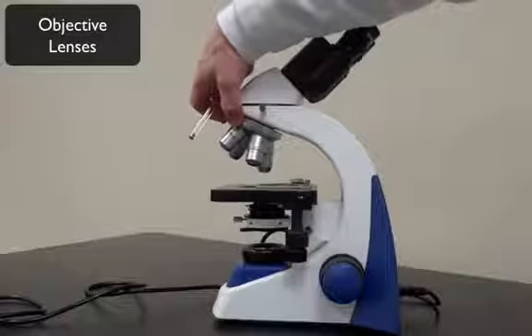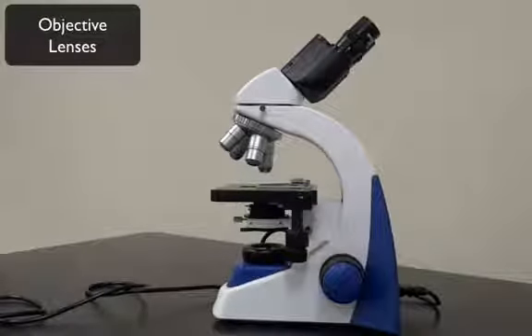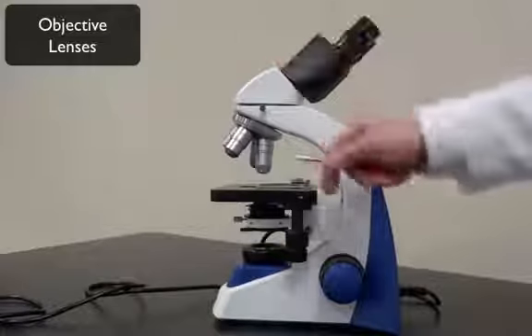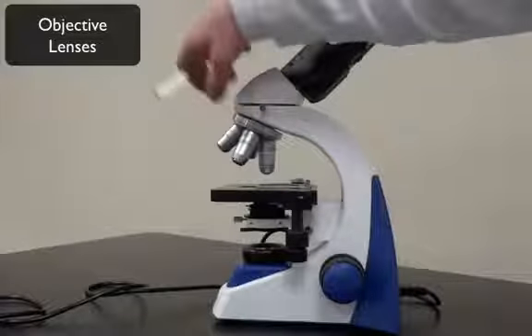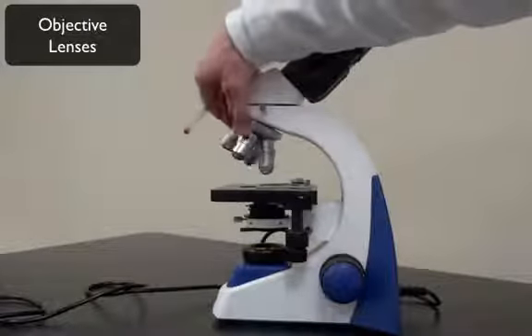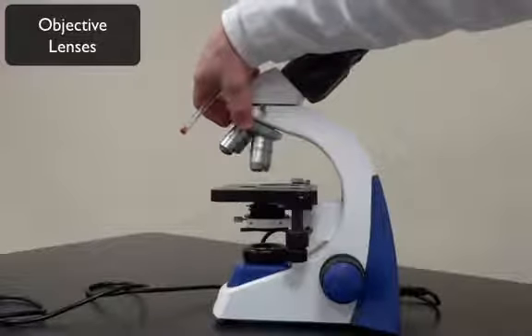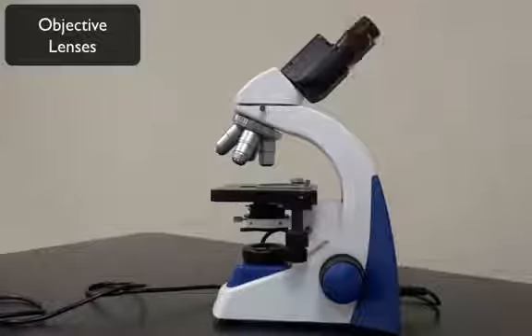The next power can be considered low or medium. In this case, we'll call it our low power, and that's 10 times the magnification. Our high power then is 40 times the magnification. And then we have one that's 100 times the magnification. That's our oil immersion lens, and we'll talk about that in part 2. Commonly, we'll just be using the scanning and low, the 4 times and 10 times objective lenses. Okay? I'm going to put this back to the scanning one.